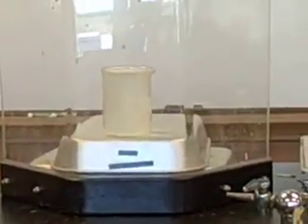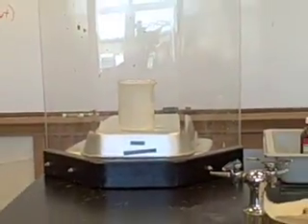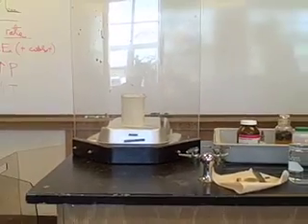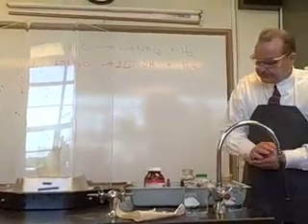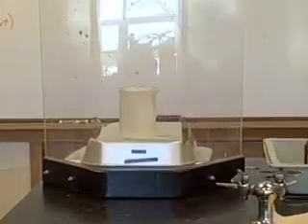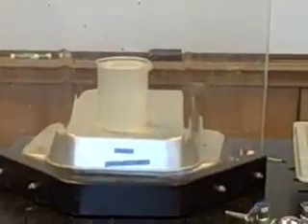Now then, sodium is more active than lithium, and lithium was more active than calcium, right? So, what trend does that follow? That's what we're looking at, the activity of metals here. I've got one more metal we'll try here in a second. We'll let that burn out before I get into the potassium.